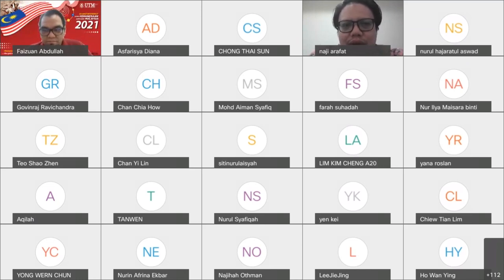Maybe one thing that I want to emphasize, Dr. Faizwan, Dr. Hasmi. Perhaps when you are preparing your report, it's nicer if you can discuss properly. For example, you are going to report your mean plus minus standard deviations in terms of the weight and all. If you find a significant deviation in the concentration or in the weighing from one set of replicates to another, you can discuss why you find that. Try to find the source of errors and indicate that in your report so that we know you are trying to discuss something. Otherwise it's going to be a reproduction of data without any substantial discussion on the analysis itself. So I would appreciate that kind of thing.